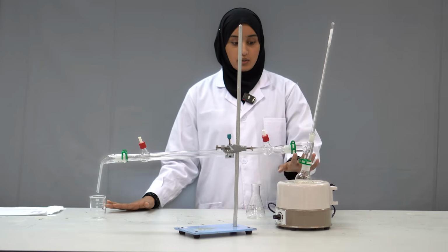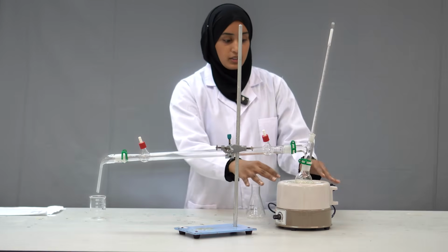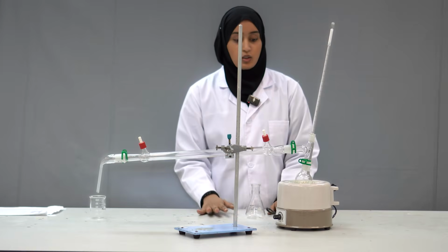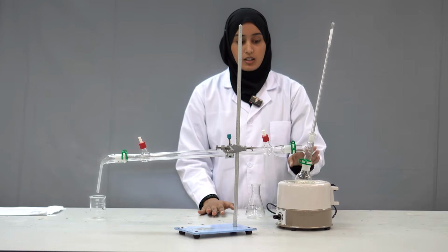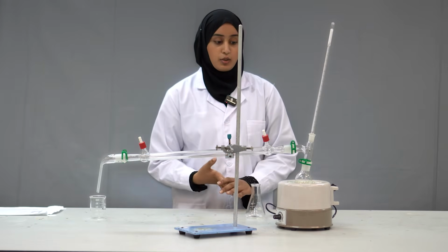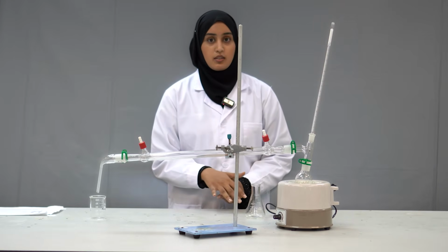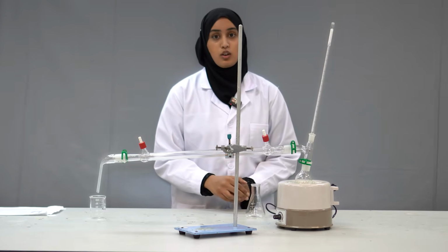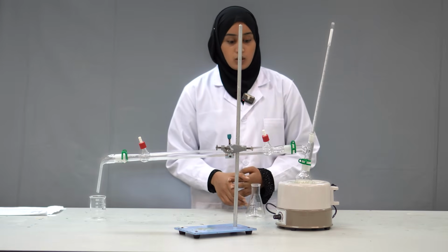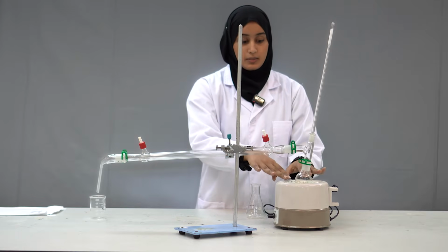Our process begins from this round bottom flask. This round bottom flask is supposed to be bigger so that it will fit into the heating mantle. Inside this round bottom flask, we are using a mixture of dichloromethane and a base. But we also add anhydrous sodium sulfate to remove excess water, and also boiling chips to prevent bumping. So we start by switching on this heating mantle, which will then heat up this mixture.